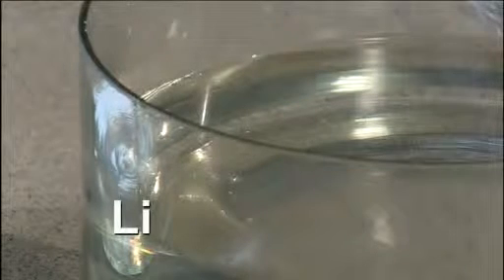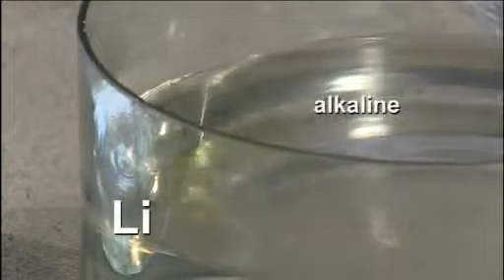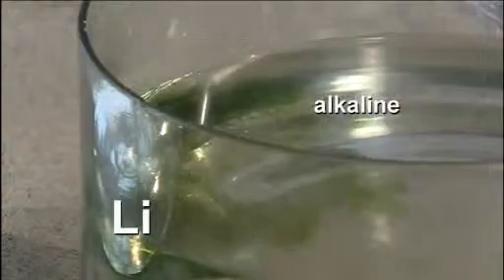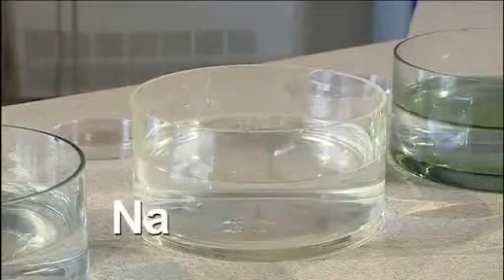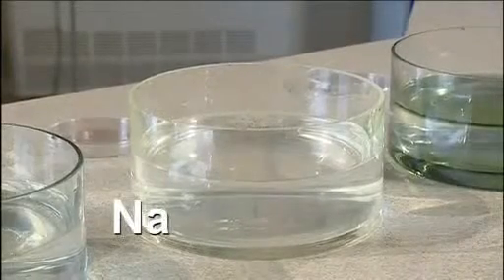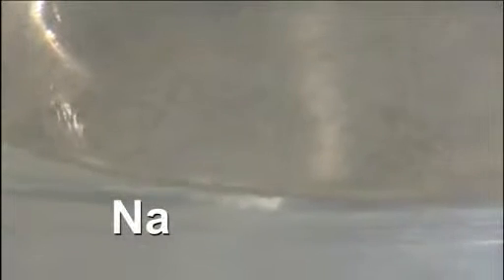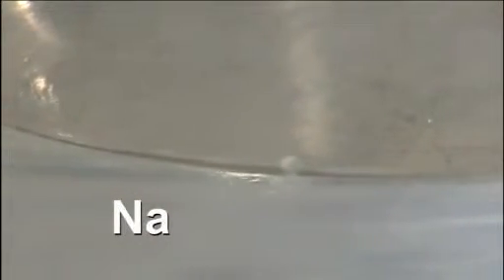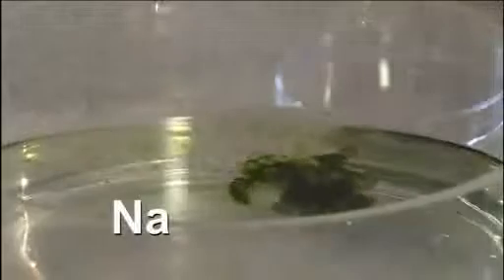When the reaction's finished, you can add some indicator. And add some indicator.